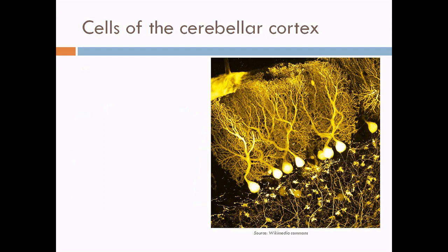So what are the cells that make up the cerebellar cortex? There are the Purkinje cells which are these flask shaped or pear shaped cells. The branched dendritic tree that emerges from these cells extends into the layer above it in a plane which is transverse to that of the long axis of the foliar. The other cells that can be seen in the cerebellar cortex are the granule cells, the stellate cells, the basket cells and the golgi cells.